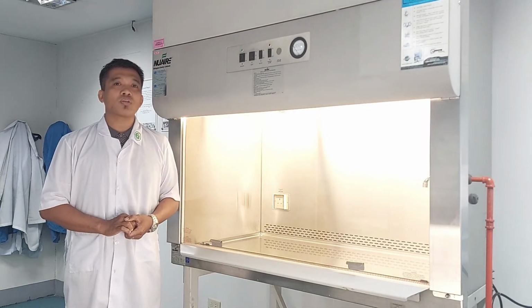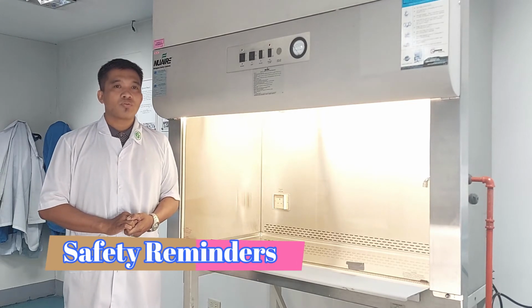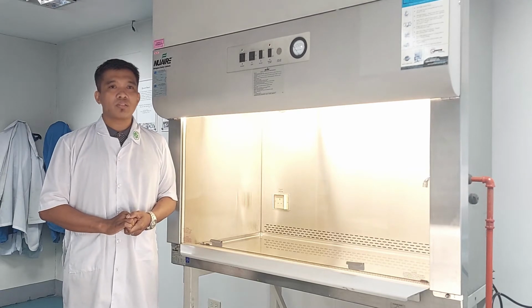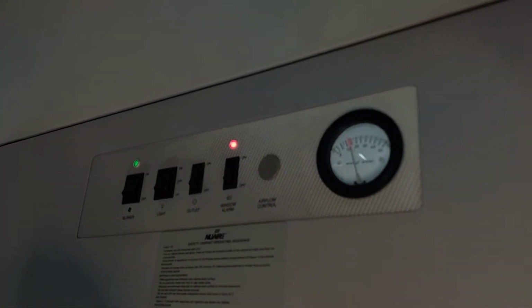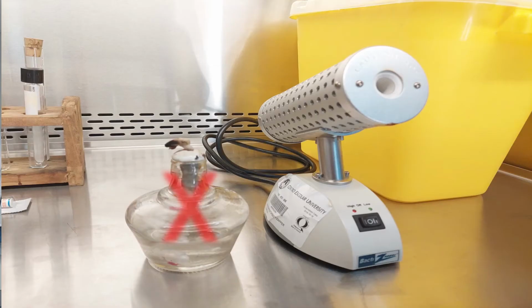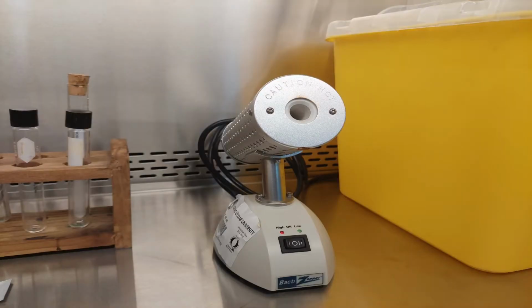Here are some reminders on working safely in your biological safety cabinet. First, do not operate the cabinet if any of the alarms are activated. Open flames should not be used. The resulting buoyancy effect will affect cabinet airflow and containment. If absolutely necessary, use a bacticinerator for decontaminating inoculating loops and needles.